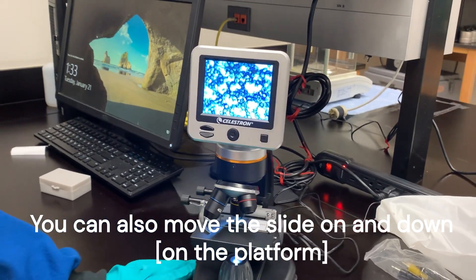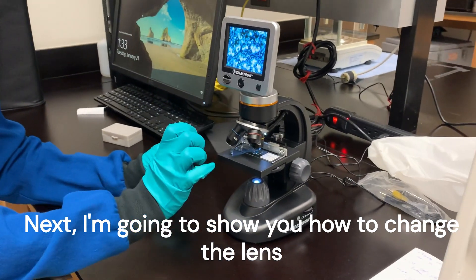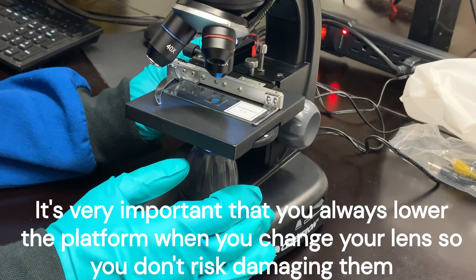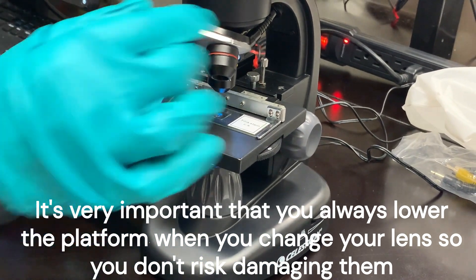Great — beautiful picture. Next I'm going to show you how to change the lenses. It's very important that you always lower the platform when you change your lenses so you don't risk damaging the lenses.